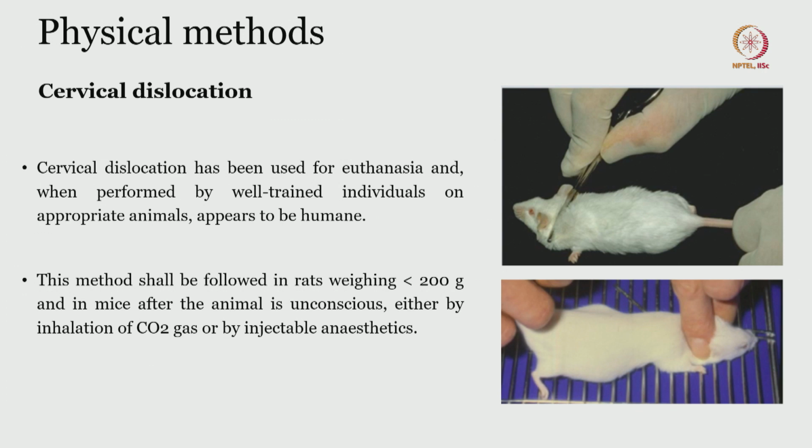For example, you are trying to study a drug which might get altered by the presence of carbon dioxide in the system, and if you want to really look at the concentration of a particular drug in the organ, then if that concentration is going to be varied by the carbon dioxide asphyxiation technique, only then you try to use these kinds of techniques, which are not really preferred otherwise.